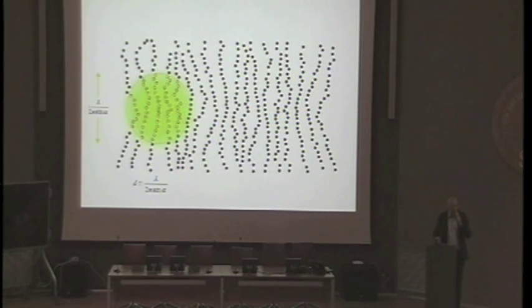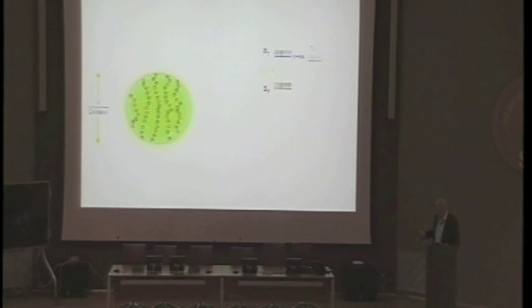Now, if this is the problem, keep in mind that all of them are flooded and illuminated at the same time and give off light at the same time. Maybe there is a solution to the problem, namely, make sure that the molecules that are inevitably flooded here at the same time with illumination light, green light, are not capable of sending light back at the same time. Because if we manage to keep some of the molecules, for example, here dark, despite the fact that we have, say, flooded them with illumination light, we may be able to separate the bright ones from the dark ones. Or you can phrase it differently.